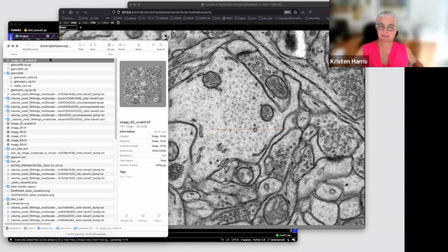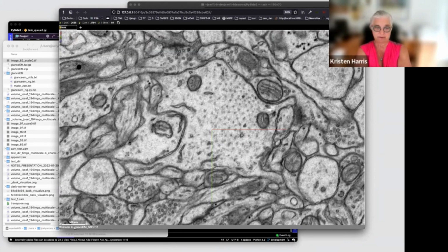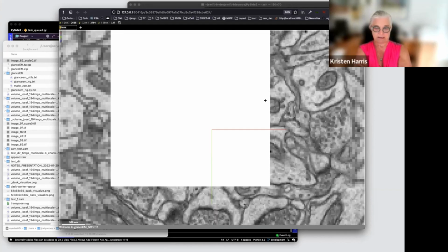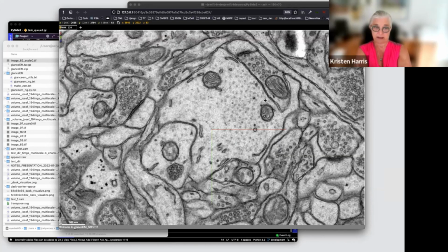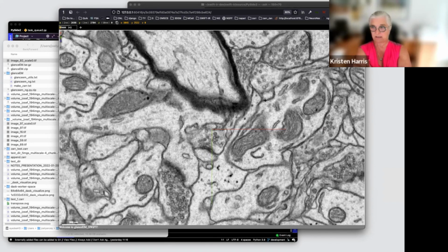As you demonstrate this, of course, I can tell you something that we find extraordinarily useful. I'm so glad we're getting really close to integrating with Reconstruct Plus, because we've all been using it really intensively for the last few papers. And so we've come to know all the keys and the hotkeys and the strategies that we use in Reconstruct that we want to re-implement. And a lot of them have to do with viewing. So it's interesting that it puts you at the center. And one of the things that you'd like to be able to do is to hit one key that zooms you out to the center, zooms you out to full screen.